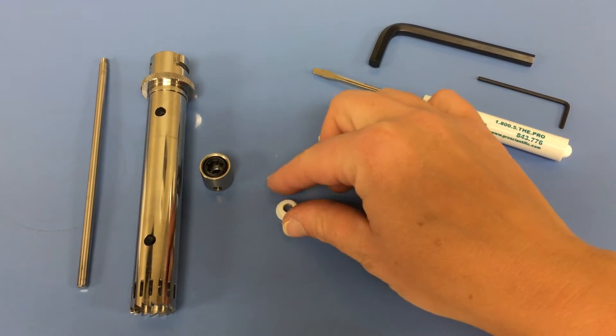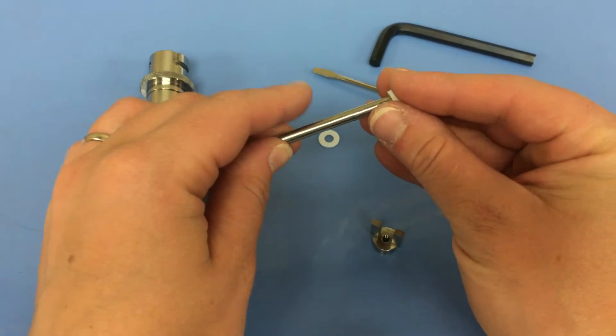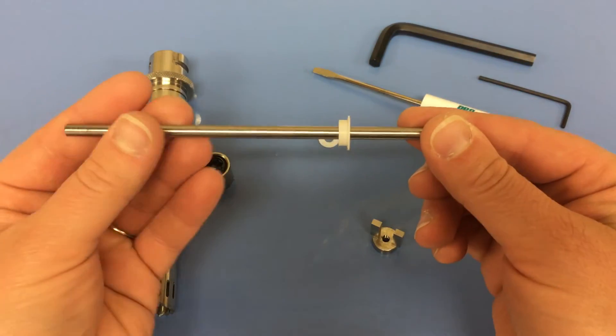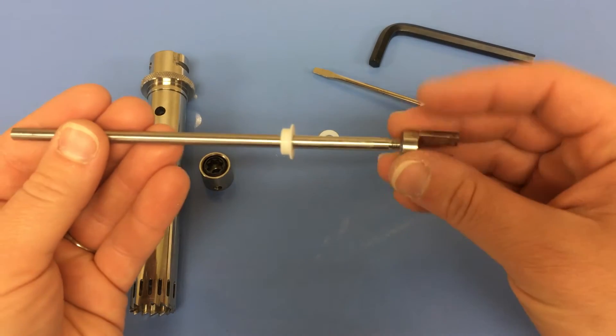Slide the lower bearing onto the rotor shaft. Attach the rotor knife to the rotor shaft by screwing it together until tight. Hand tighten it only.